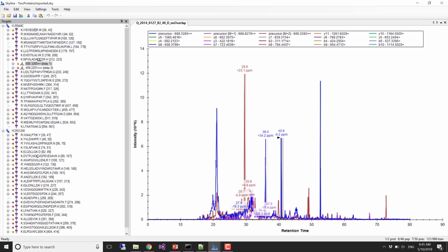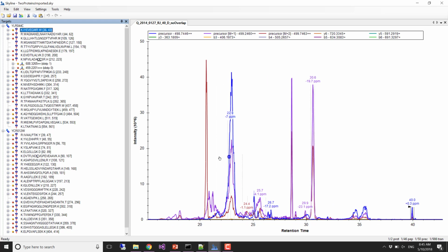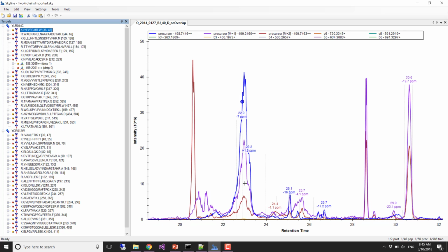So here, if I look at this first peptide, it's kind of hard to see because Skyline picked this thing, and there are all these really big things, and some of them maybe even look kind of nice. That one has probably some similarities to my precursor of interest.